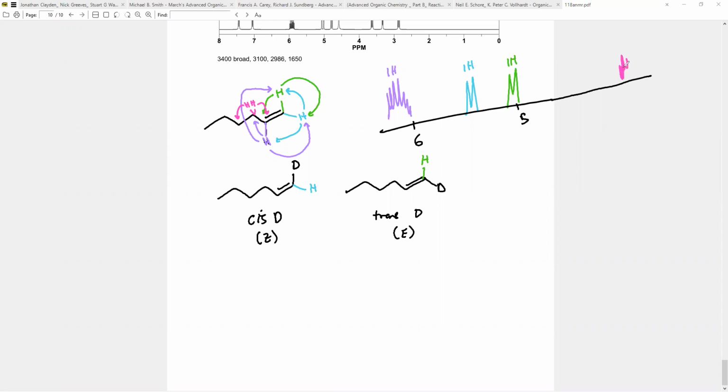So what we'll tend to see is really weird peaks. I'm trying to show this, so I'll show it to you. I had one like this on here. Really weird peak that's kind of bolded, I like to think of it as. This over here is around 2 to 3.